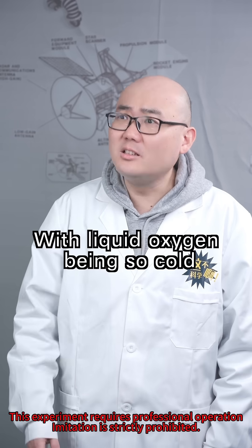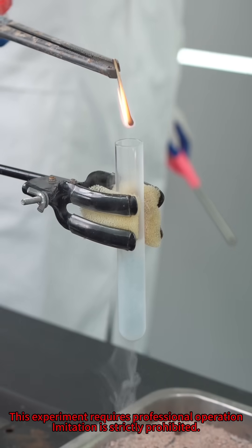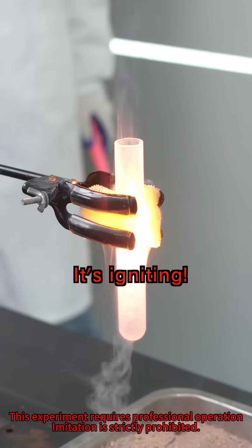With liquid oxygen being so cold, it'll definitely extinguish. Watch carefully. It's ignited!